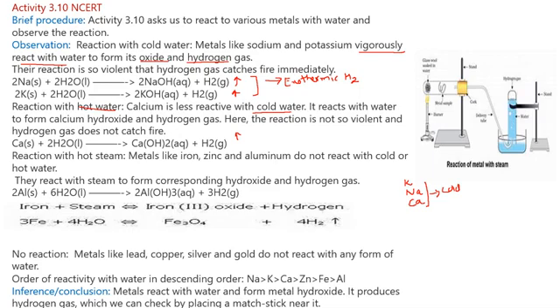Though it is an exothermic reaction, it is not as vigorous as the above two reactions. But you will find that calcium's particles are floating on the top, on the surface, right? Why? Because they stick to the hydrogen bubbles. Very important question that can be asked in exam.